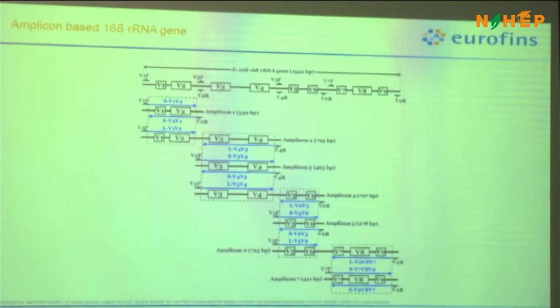So going into more detail, in 16S, I've taken this example because many of you must be doing bacterial 16S. Now in 16S, if it's a pure culture, we go with Sanger and identify that. We do something different when it is a mixed culture, where we have mixed stuff, and we are also capturing uncultured bacteria.